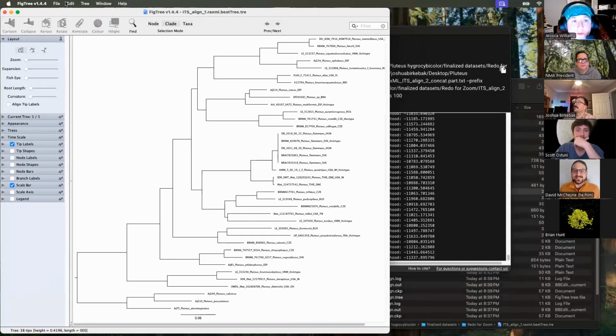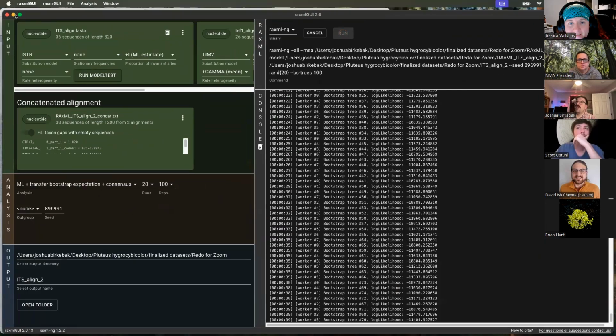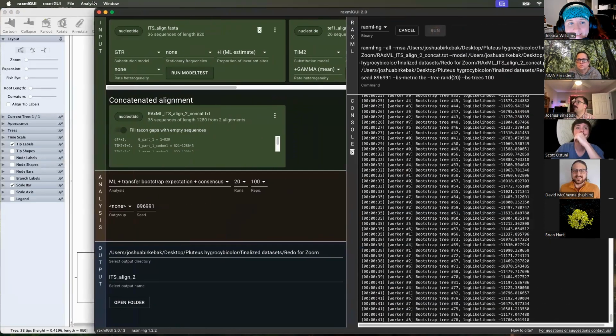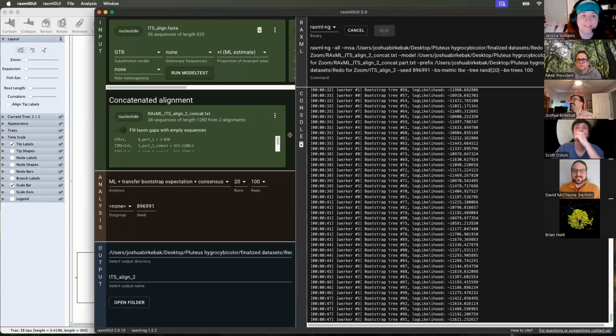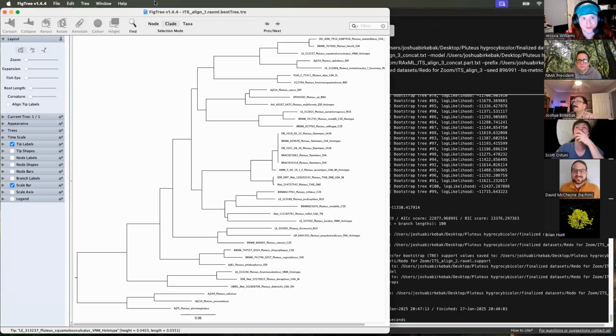No, this is extremely informative and I appreciate it. All right. And I'm doing a speed run version of validating sequences, right? Obviously. Honestly, all I need... Like, yeah, because it's not complicated. It's just knowing the order of operations of what to export from what and what to click where, and then also when it throws that random error, what to do with it, you know. And then just me butting my head up against this for a long time. I am decent at computers, so I can troubleshoot stuff as long as I know what programs to use and in what order to do it, you know?